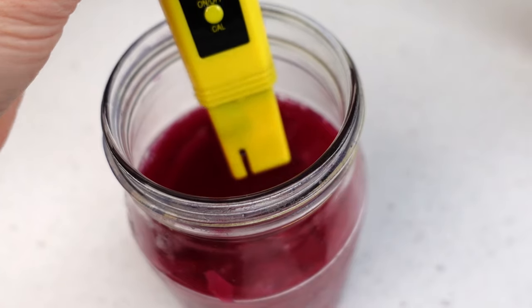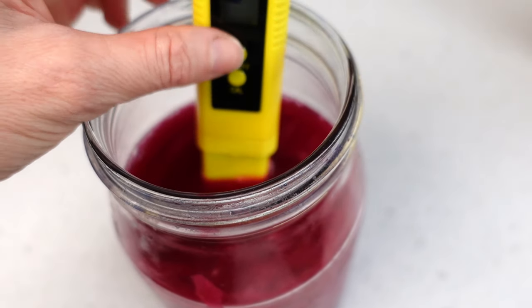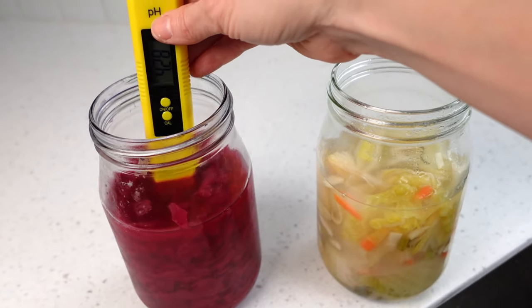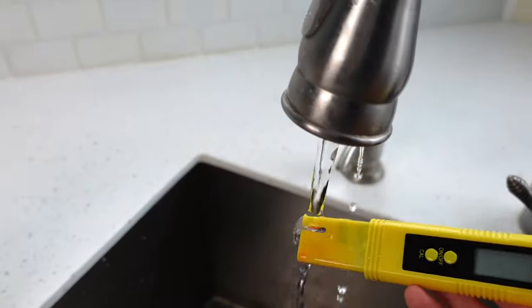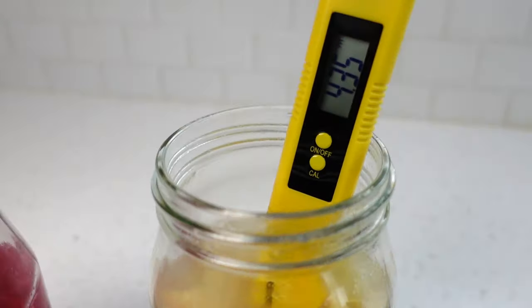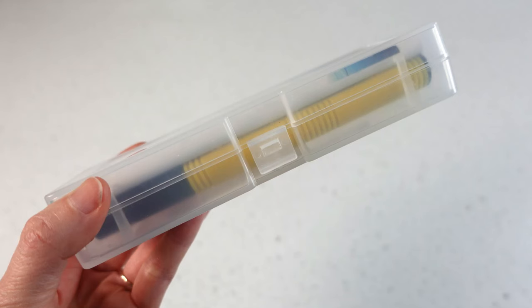Now that the meter is calibrated, here's an example of how to take a pH reading. Place it in liquid and turn it on. Take the reading, remembering not to go deeper than the immersion line. When done, turn it off and rinse it with tap water. If you have another ferment to test, place it straight in, turn the meter back on, and take the reading. When done: rinse, cap, case.